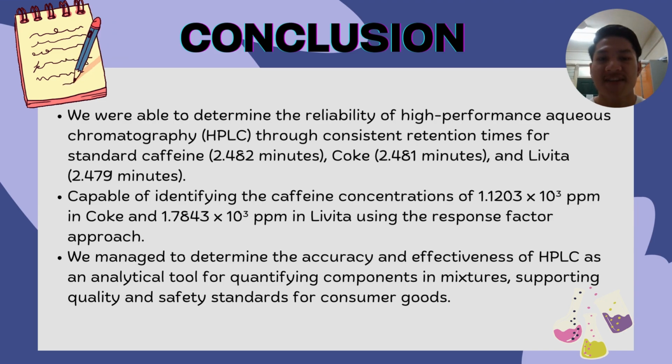In conclusion, the present study used high-performance liquid chromatography (HPLC) to achieve its objective. The retention time for the standard caffeine solution was 2.482 minutes, similar to Coke at 2.481 minutes and Levita at 2.479 minutes. This consistency shows that HPLC is reliable for detecting caffeine.